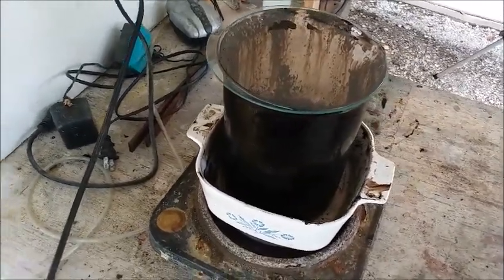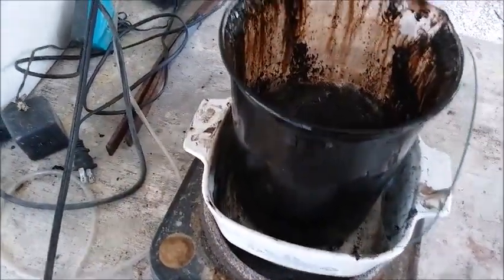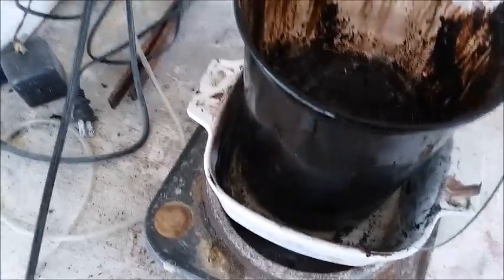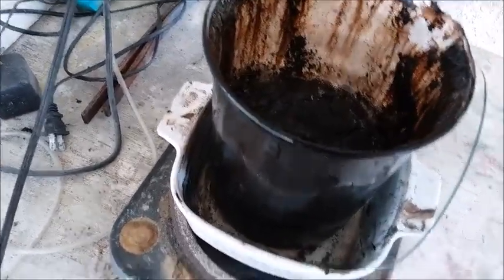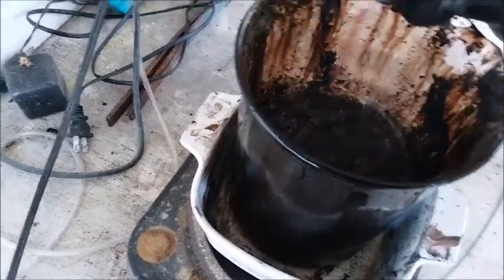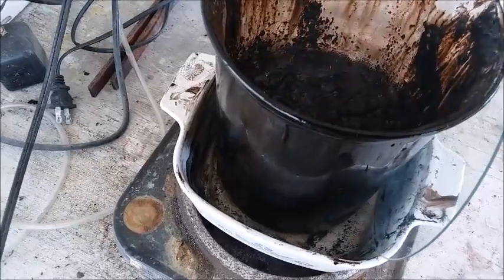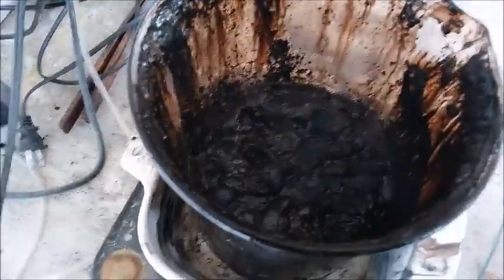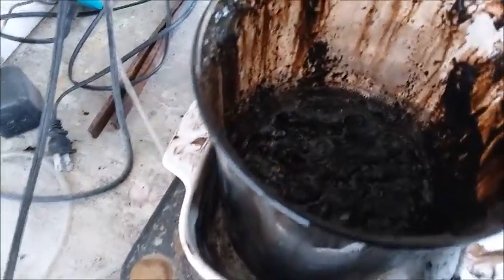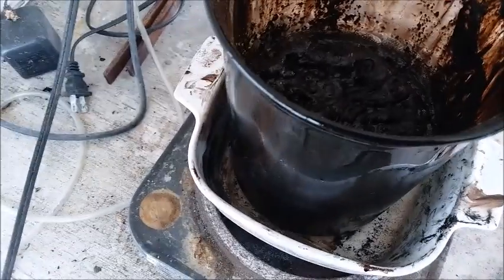All right, the reaction's pretty much back under control. In fact, I'm wondering if it isn't mostly done after that runaway. I don't normally let it get that hot and run away like that. I normally let it run for a much longer period of time at a lower temperature, just so I don't get a runaway like that. All right, I think the level of the acid has risen quite a bit. I don't think there's that much foam in there right now.